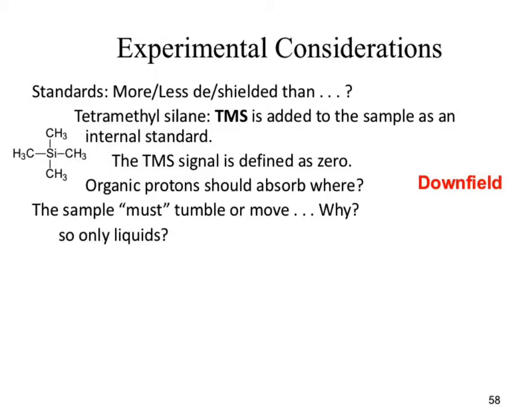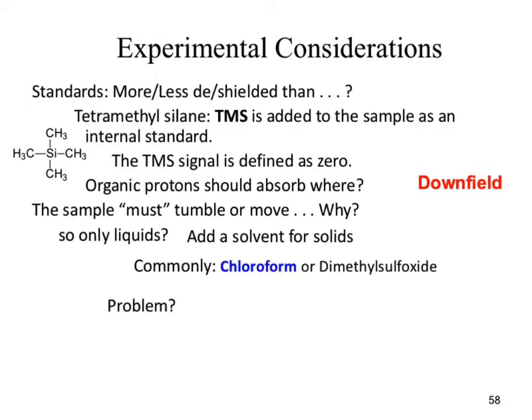So when I pick a solvent, the solvent cannot have hydrogens or carbons in it. Well, carbons becomes a little bit less important because we're looking at carbon-13. Chloroform ends up being the solvent that's typically used. The other one is dimethyl sulfoxide.